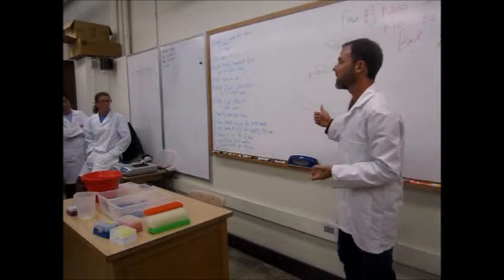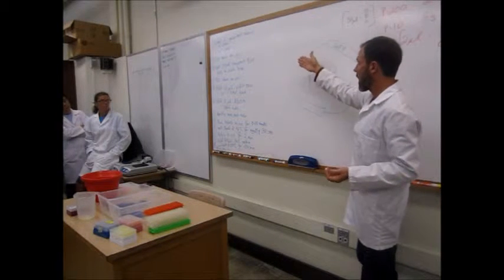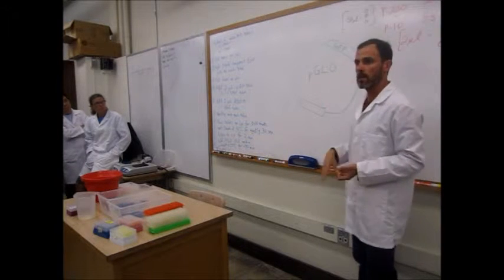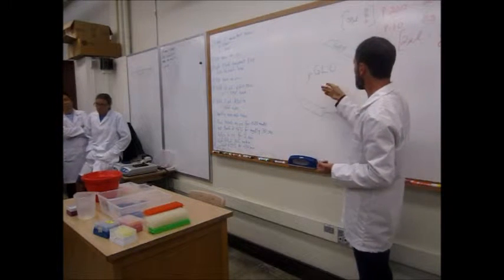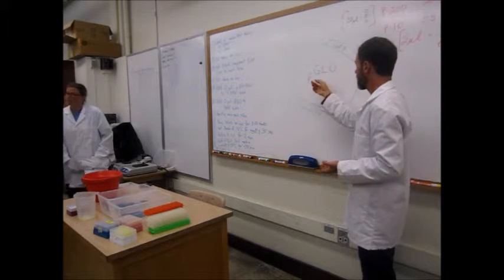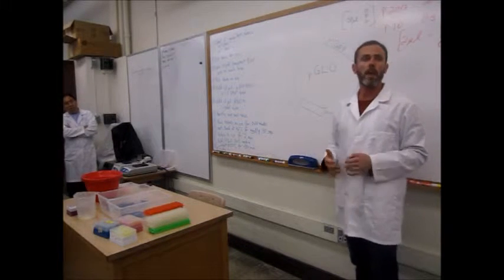What we have in the test tube is the competent E. coli cells with this pGLO DNA. And I want to explain what this plasmid is. So this is roughly a map of this plasmid. And that's what the P stands for. But what is a plasmid?